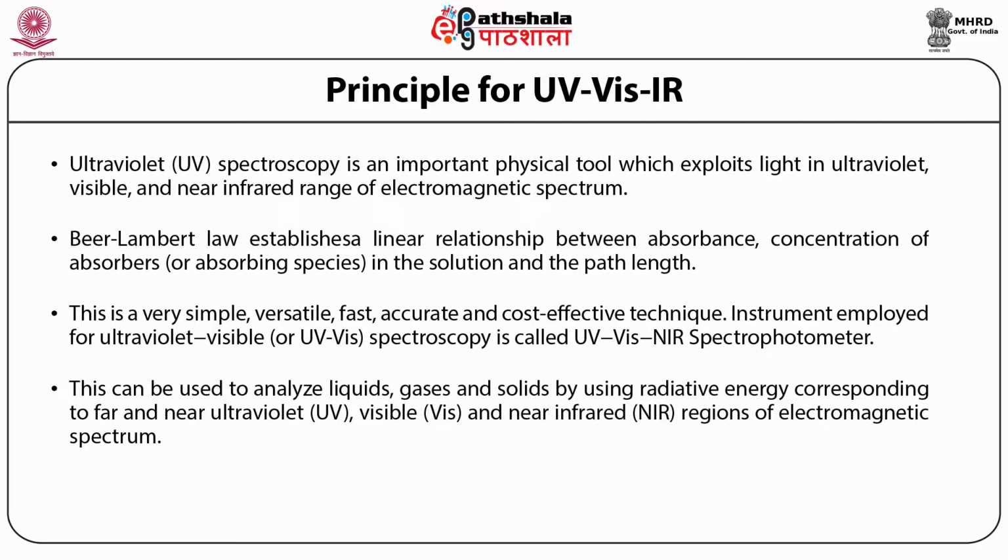This can be used to analyze liquids, gases, and solids by using radiative energy corresponding to far and near ultraviolet, UV, visible, vis, and near infrared, NIR, regions of the electromagnetic spectrum.